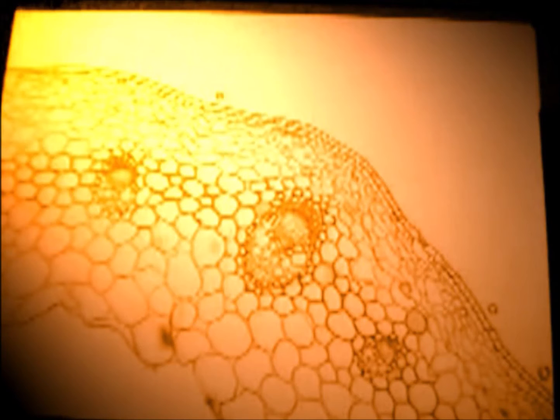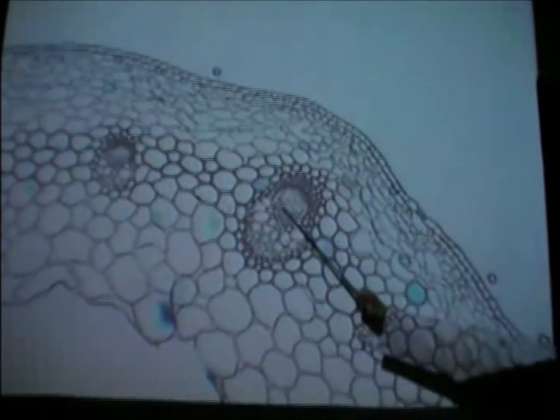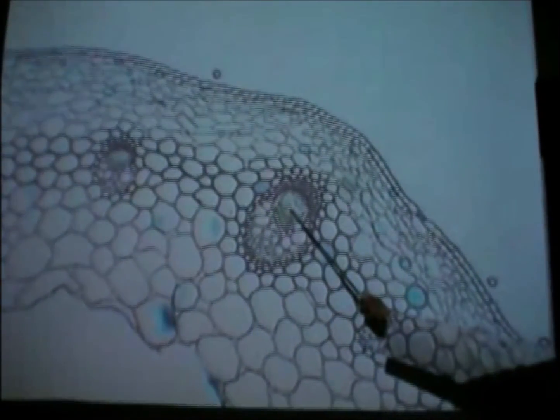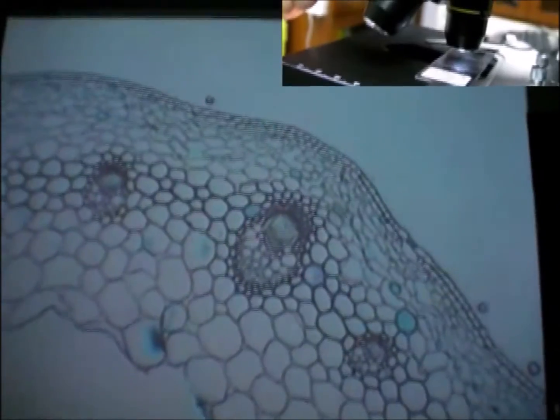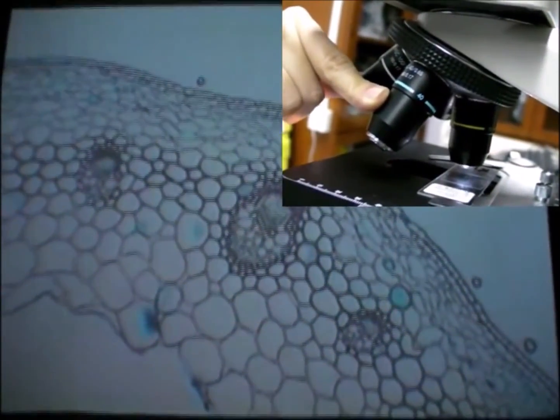Hence, it is important that you always bring the object that you want to magnify further to the center before you change to the next higher magnification of the objective lens. Choose the cells which can best represent the rest of the cells, that is, the structures and organelles within the cells that you have learned from theory. They should be visible in the chosen cell.